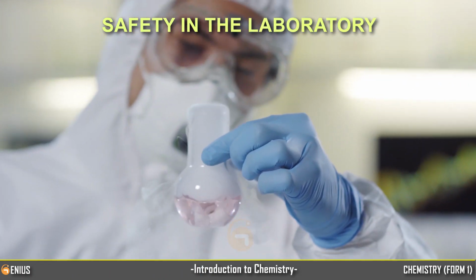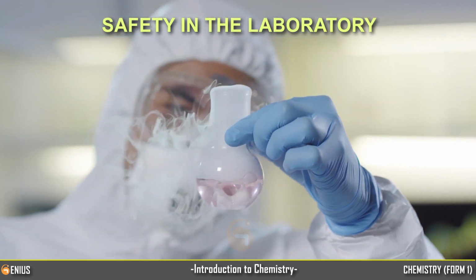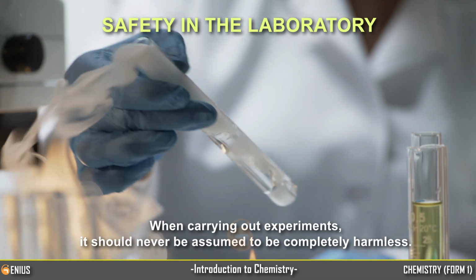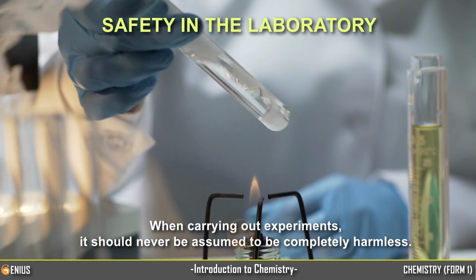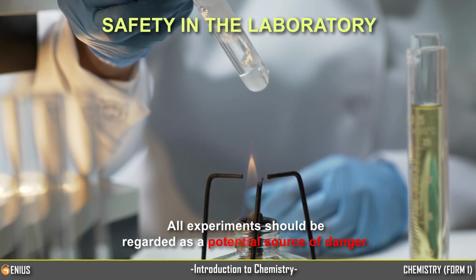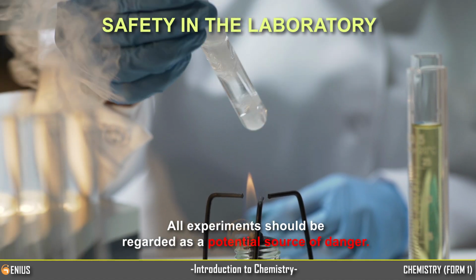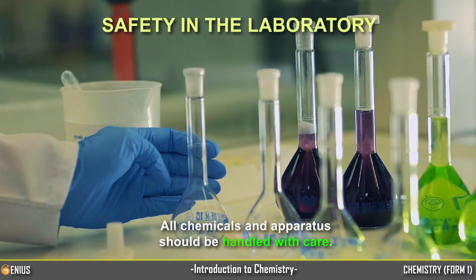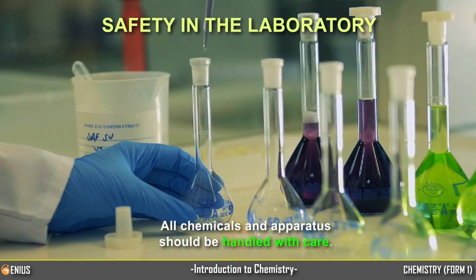Safety in the laboratory. When carrying out experiments, it should never be assumed to be completely harmless. All experiments should be regarded as a potential source of danger. All chemicals and apparatus should be handled with care.